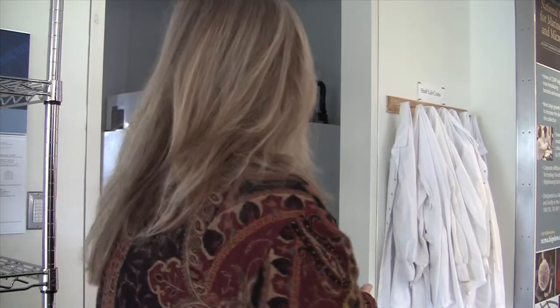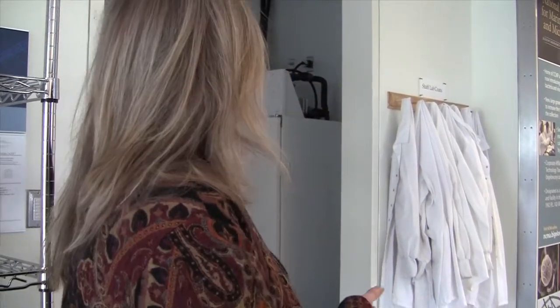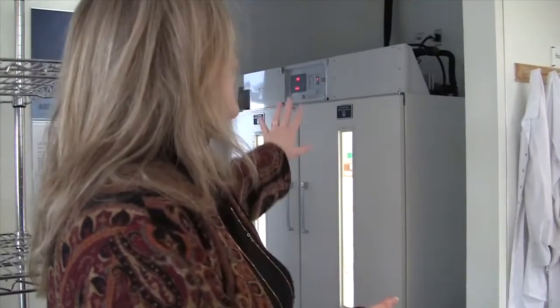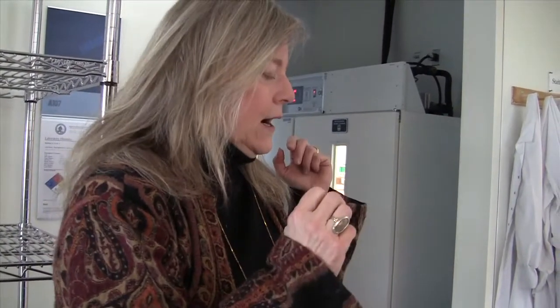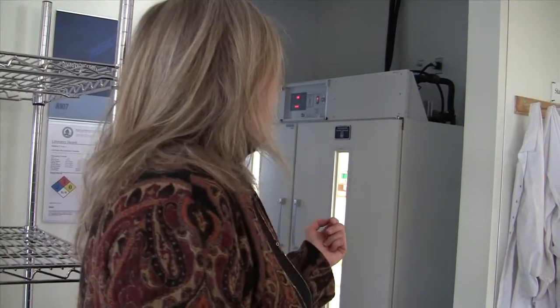It's kind of like a living library. And all of it is in different chambers at different temperatures. We have the responsibility of keeping it all going. It's got backup downstairs. As many of them that can be backed up are backed up by cryopreservation. So we have some of them frozen. Some of them are just in a backup system that runs on a separate generator. So if anything goes wrong, we will still have the collection.